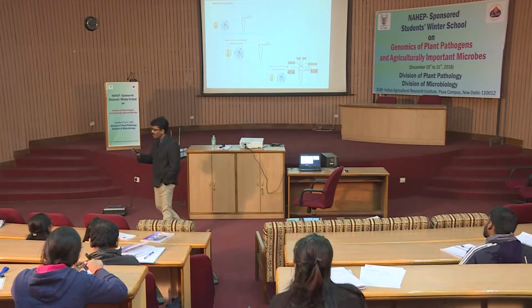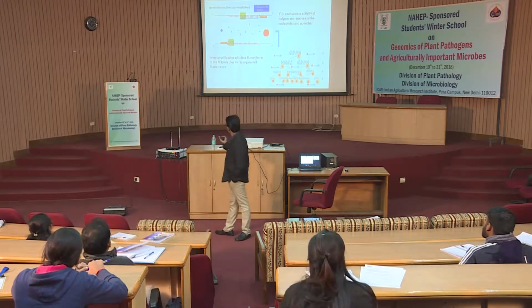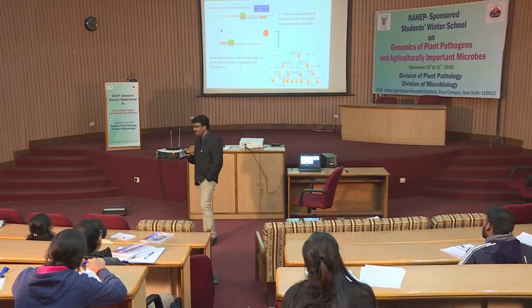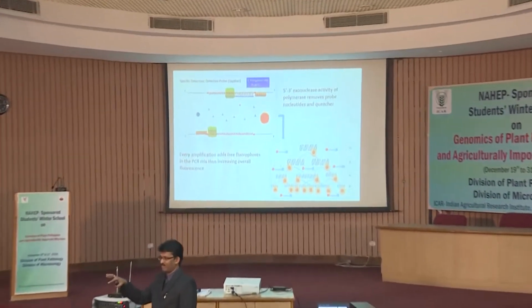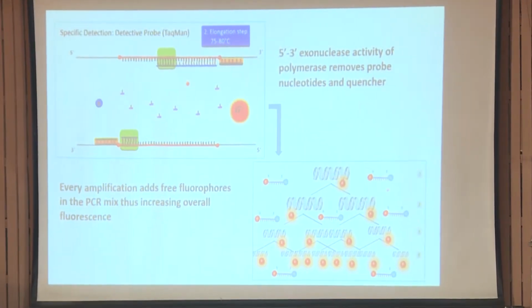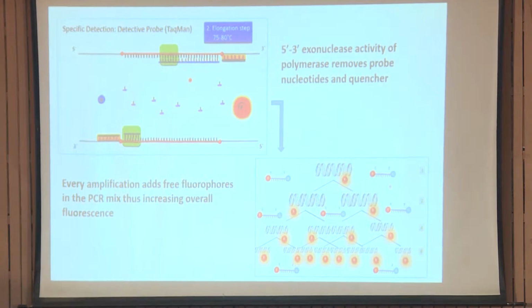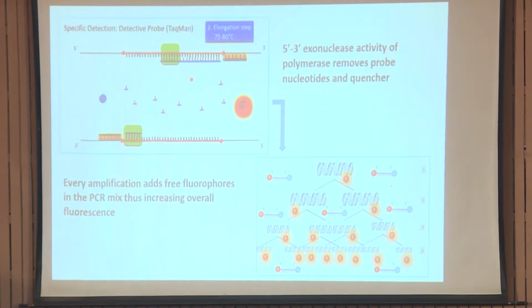As and when one cycle is completed, you are going to see the free fluorophore which is coming out of that particular strand. So every amplification step is going to contribute a free dye molecule in the solution. So that is tracked. Okay.